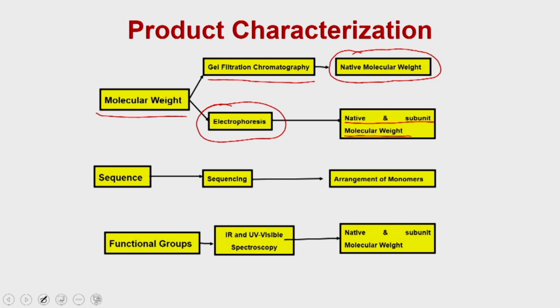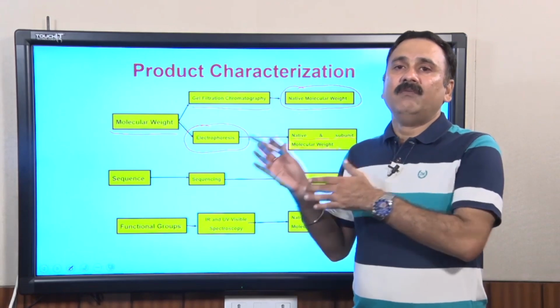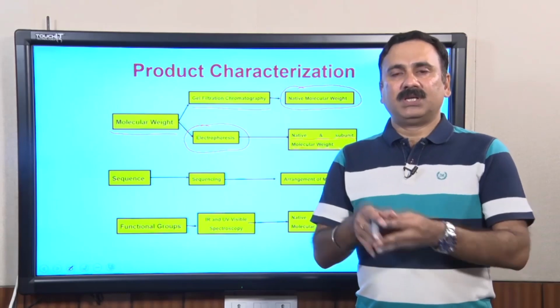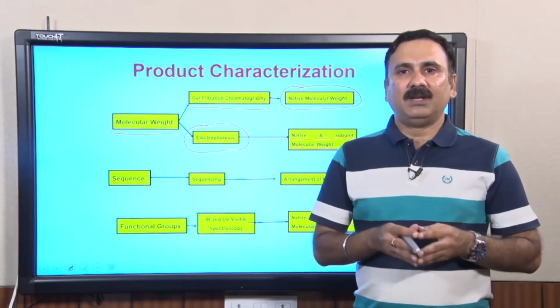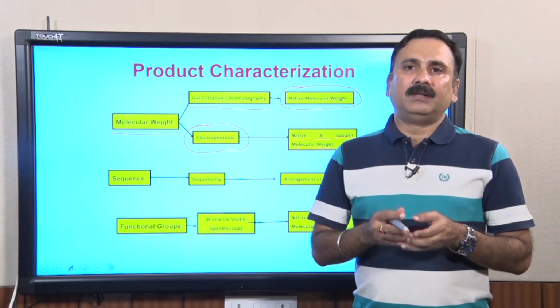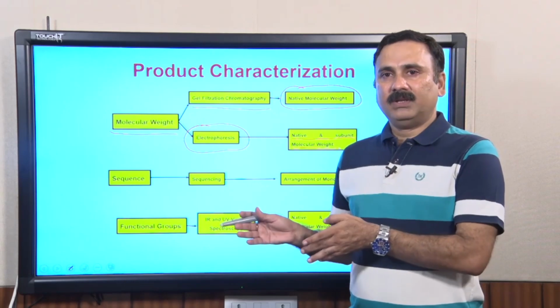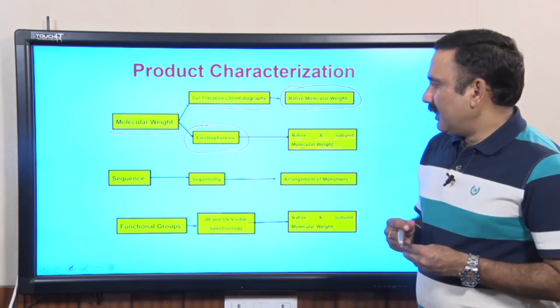In addition, while discussing electrophoresis, we also discussed its different applications, and how electrophoresis can be used in conjunction with electroblotting techniques to check whether the isolated product has any immunoreactivity with the developed antibodies.